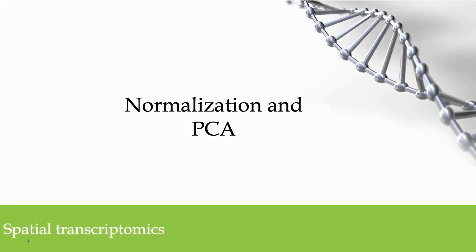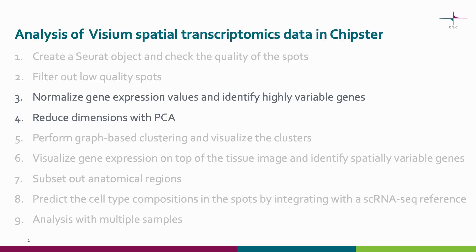In this video, we will cover the normalization and PCA step when analyzing Visium spatial transcriptomics data in Chipster. This step consists of two methods: normalization with SC-transform and dimensionality reduction with principal component analysis.